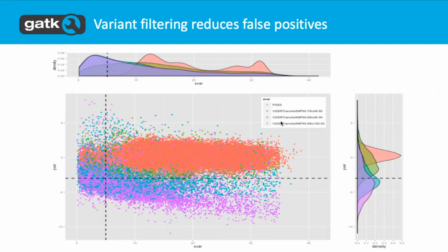And all these pink dots are the ones that have passed the threshold for being good variants. So if you wanted to do this with, say, 2 annotations, you take any 2 random annotations on the X and Y axis, and if you try to form a box to enclose the good variants, there's no real good way to do that with 2 annotations. If you try to adjust these 2 lines in such a way that you encapsulate the good passed variants, it gets a little difficult.